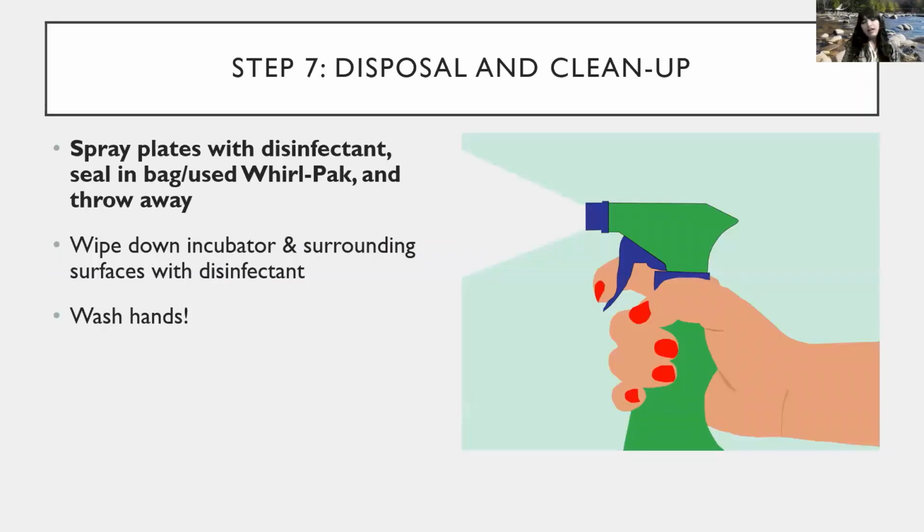But moving on to our 7th protocol, which is disposal and cleanup. So, wrapping up, we've counted, we've calculated. We want to make sure we disinfect our working area and dispose of all of our materials. So the sample water from your Whirl-Pak could be dumped down the drain or in the toilet. You can also use it to water your plants.